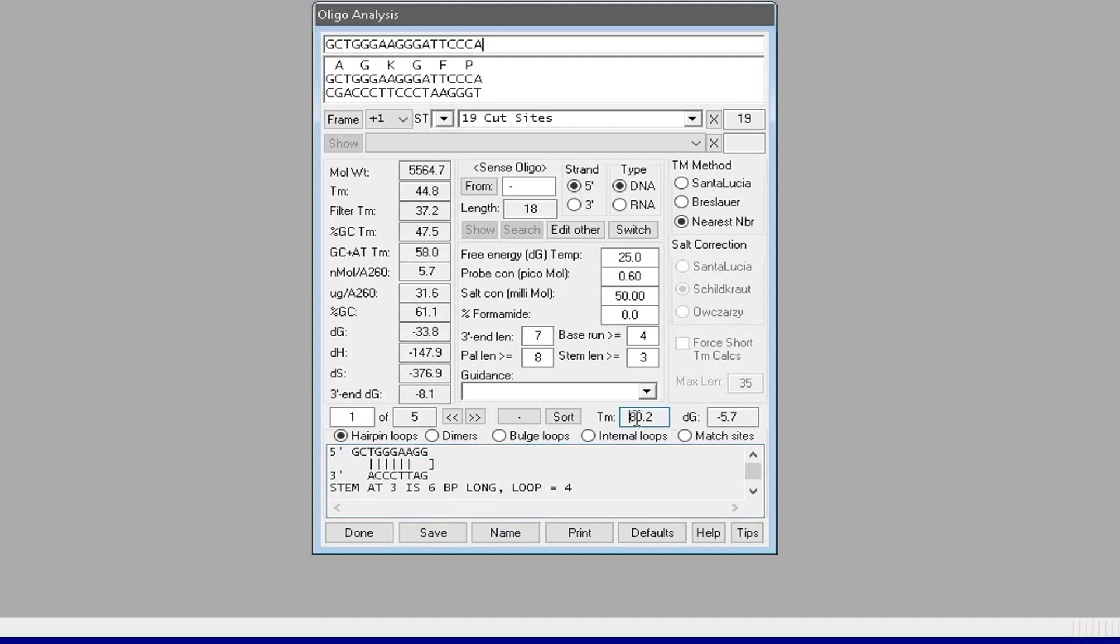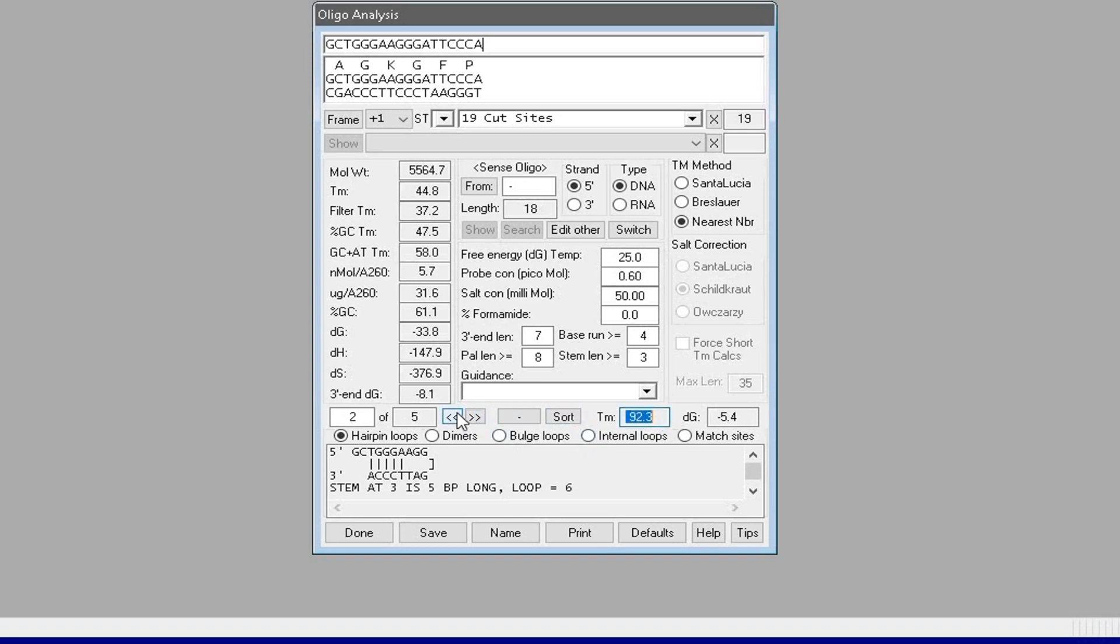The first hairpin loop will form when temperature reaches 80.2 degrees Celsius during the thermal cycle. Similarly, the other hairpin loop formations may form upon reaching specific temperatures during the thermal cycle process.